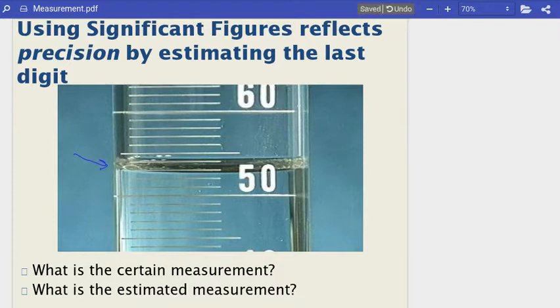When you're looking at, for instance, this piece of glassware, you'll notice this kind of double bubble area. That is due to the cohesion and adhesion between the solution in itself and the solution and the glassware, which creates that kind of, well, double bubble thing. That's called a meniscus, which sounds like the thing that's in your knee. It's not the thing that's in your knee, but this is very common with most solutions when poured into glassware.